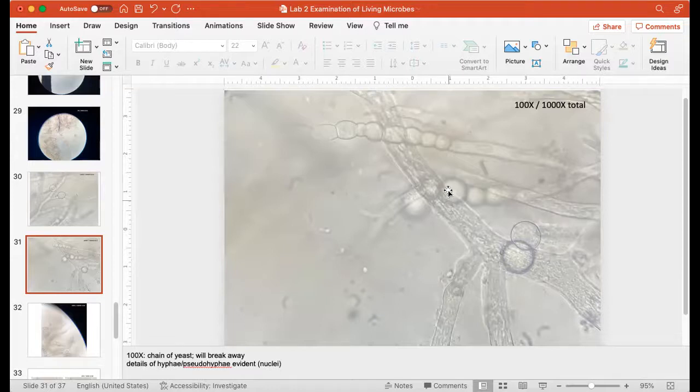Much bigger. These are fungi. They are eukaryotic. They're much bigger than prokaryotic cells. These black dots here that you can see, these might be bacteria. Bacterial cells are much smaller than yeast cells or animal cells or plant cells. They're much smaller.